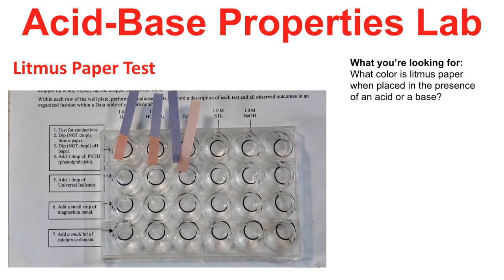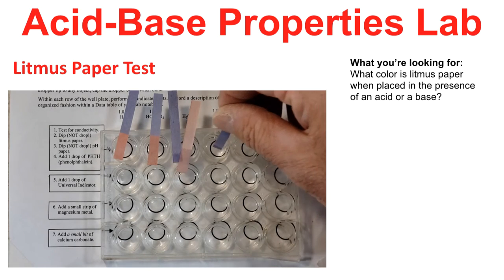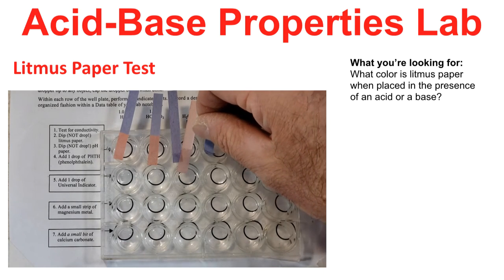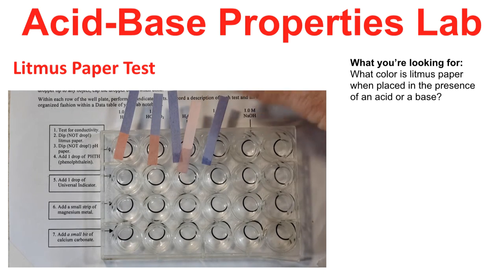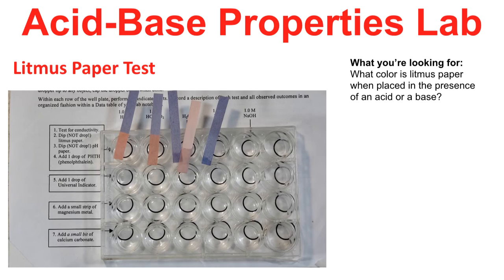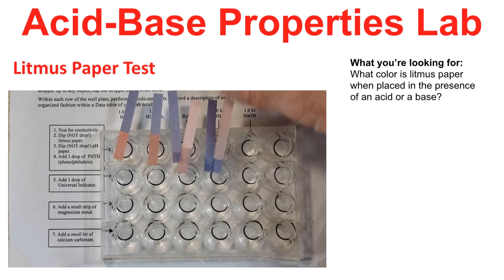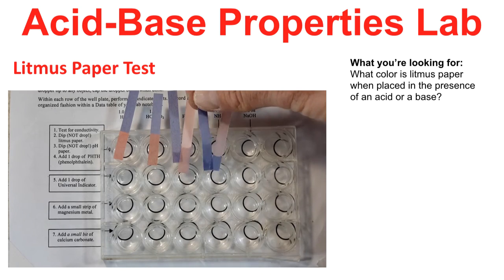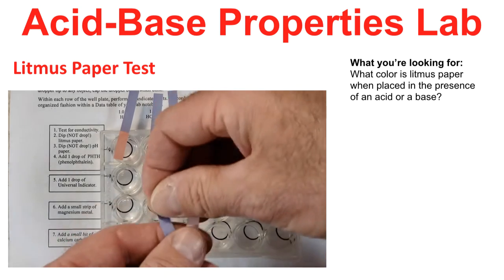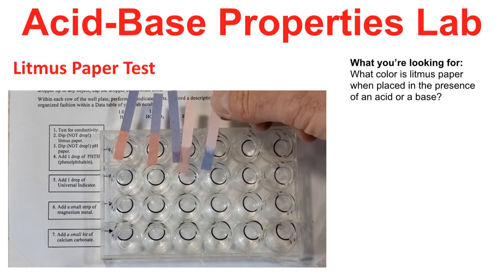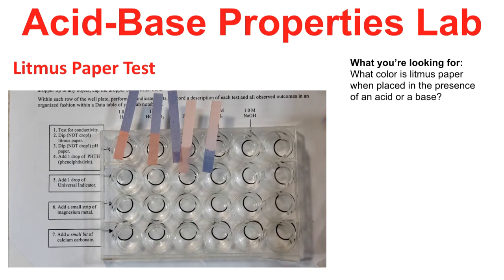Now we're going to put the litmus paper in the basic solutions. In NH3 first — the blue goes in and it doesn't turn color. So we try the red, and the red litmus paper turns blue. It appears that litmus paper will be blue when placed in a basic solution. We test our final solution, NaOH, with red litmus paper, and the red turns blue again.